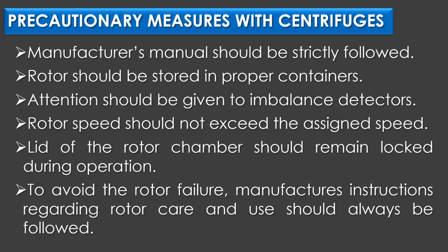Precautionary measures with centrifuges. A centrifuge user should strictly observe the following precautions. First, manufacturer's manual should be strictly followed. Second, rotor should be stored in proper containers. Third, attention should be given to imbalance detectors.